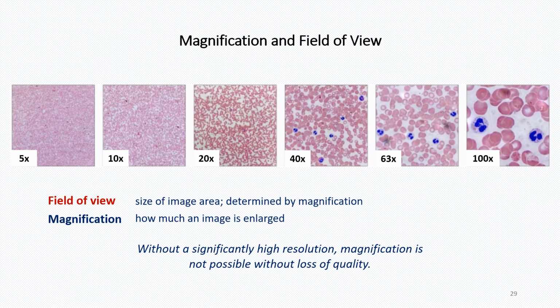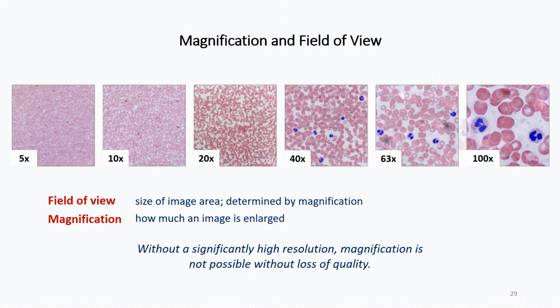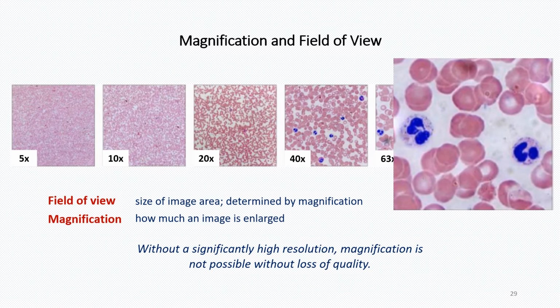The field of view is the area of the object that is imaged by a microscope system. The size of the field of view is determined by the objective magnification. In optical microscopy, resolution is somewhat a subjective value because at high magnification, an image may appear unsharp, but still be resolved to the maximum ability of the objective.